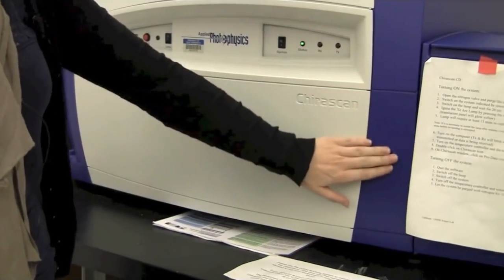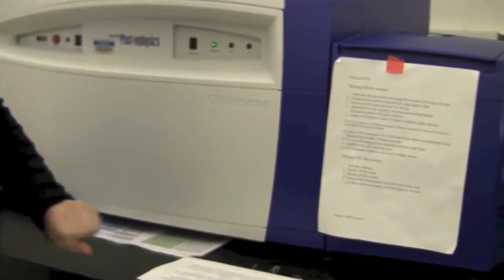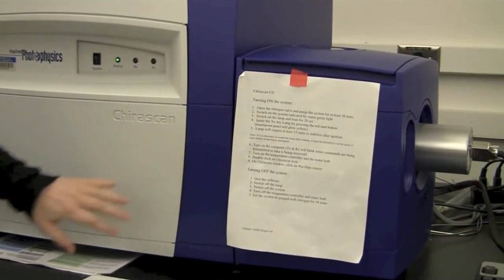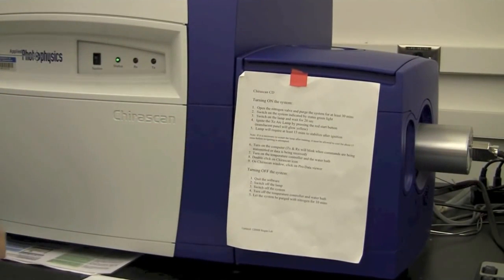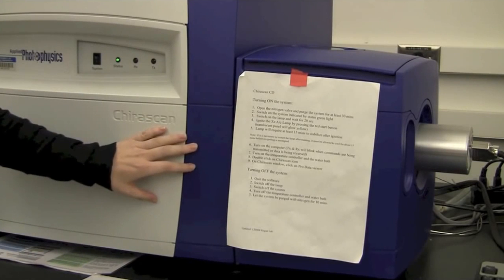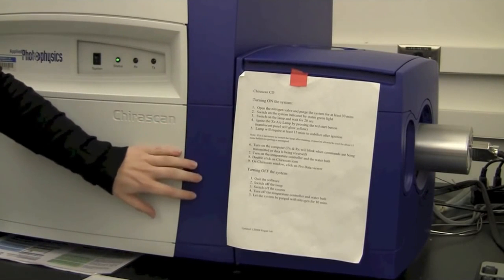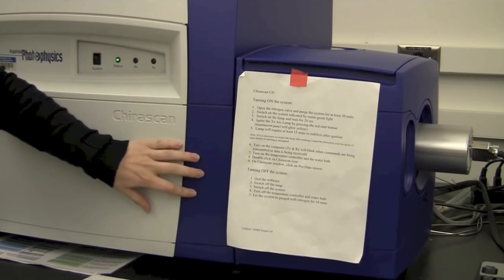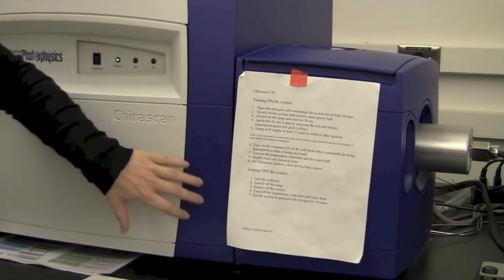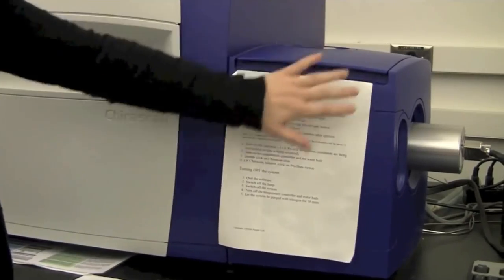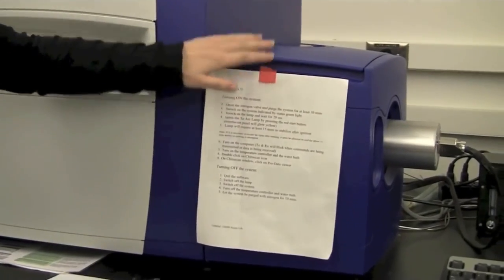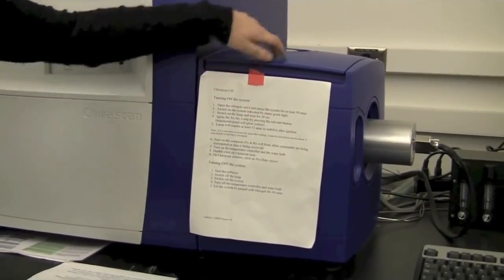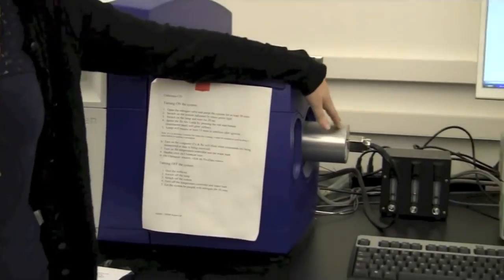Then in here we have behind the parts here we have a photoelastic modulator. That is where you generate the circularly polarized lights. We have the sample handling unit here which is where you place your sample and we have a detector.